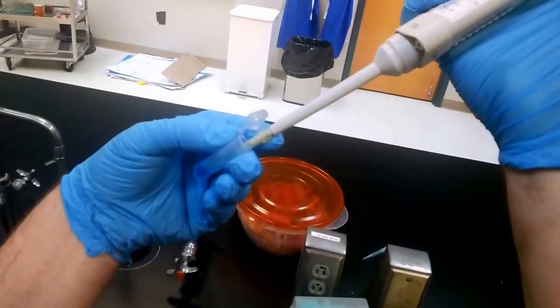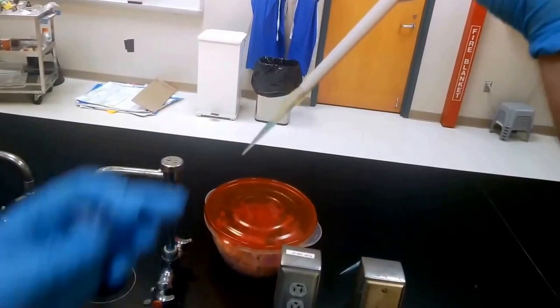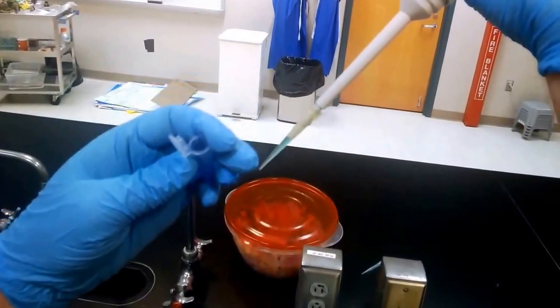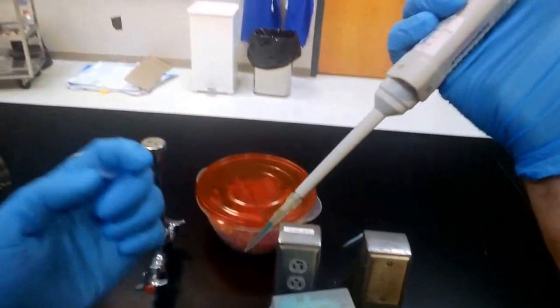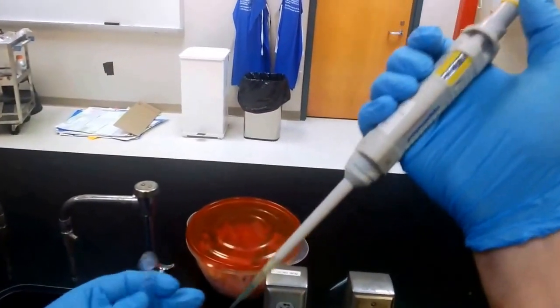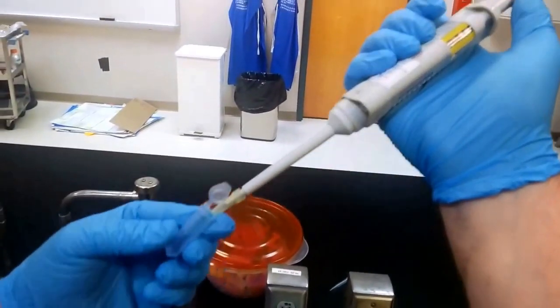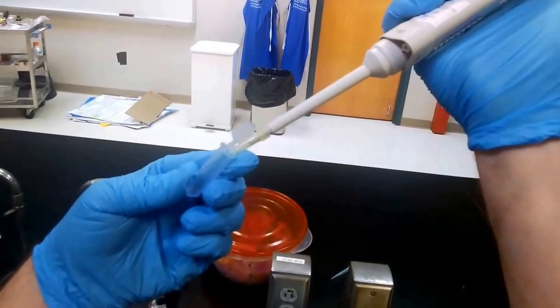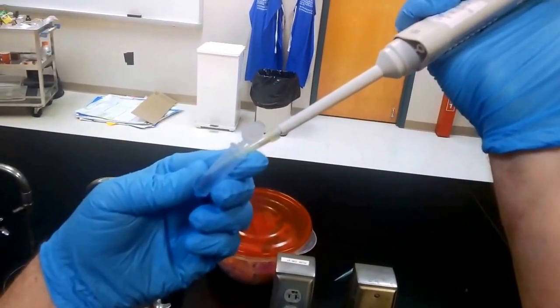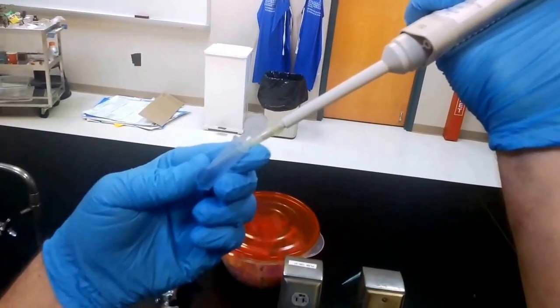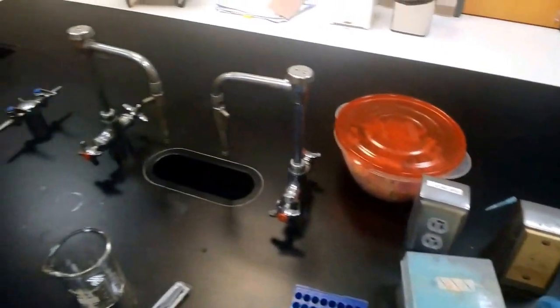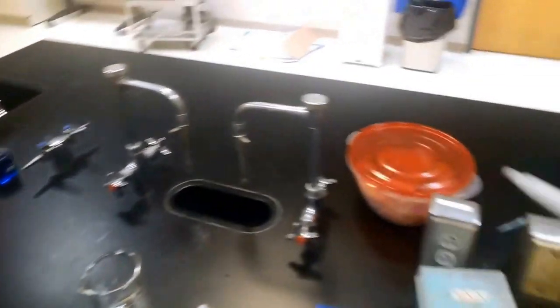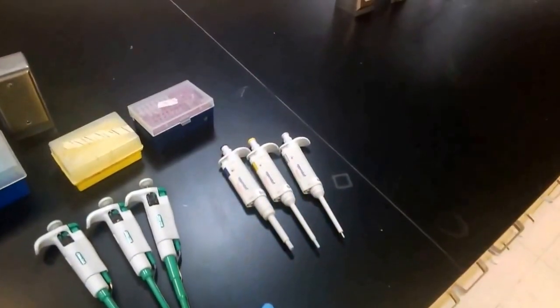All right, close the lid. Grab our tube that we're placing this into. Come inside, depress the button to the first stop, and then go to the second stop to provide the poof of air. Pull out, close the lid, and then eject our tip into our waste bin.